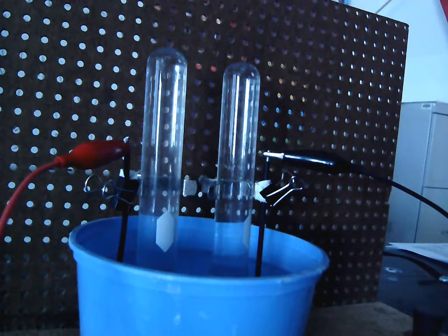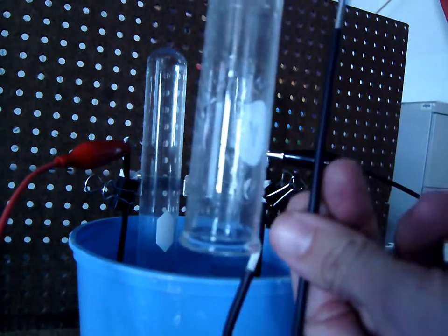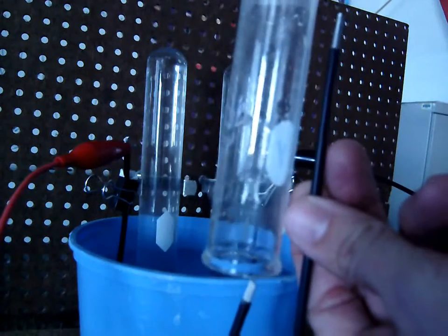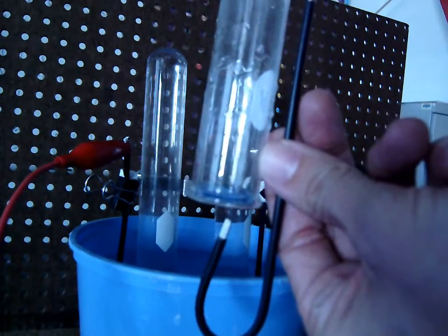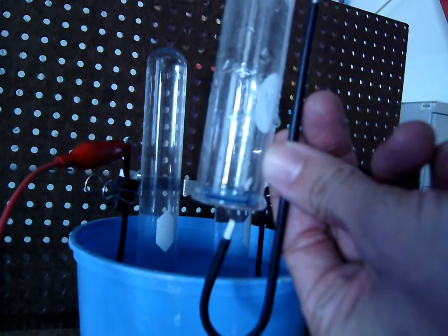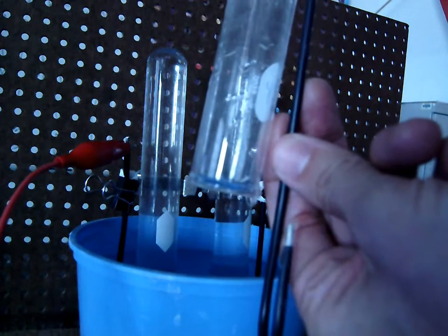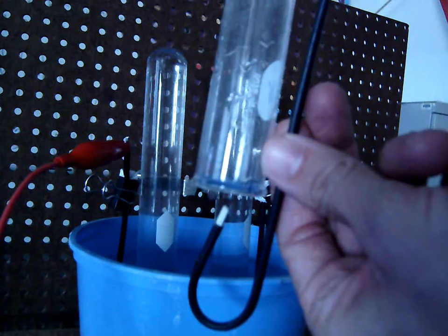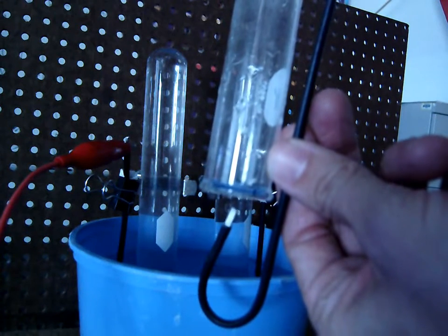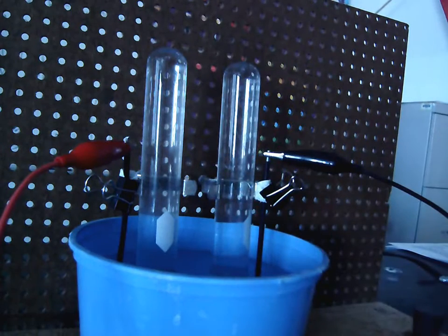Let me show you outside the water. Here's the test tube, and then the end of the electrode is just below the level of the test tube, but it's directly underneath the opening of the test tube. So it has to be like this. If the electrode were out here, then this process wouldn't work. The electrode has to be to where the end of the electrode is directly under the mouth of the test tube like this. And so that's how we have it set up in this little bucket of water.